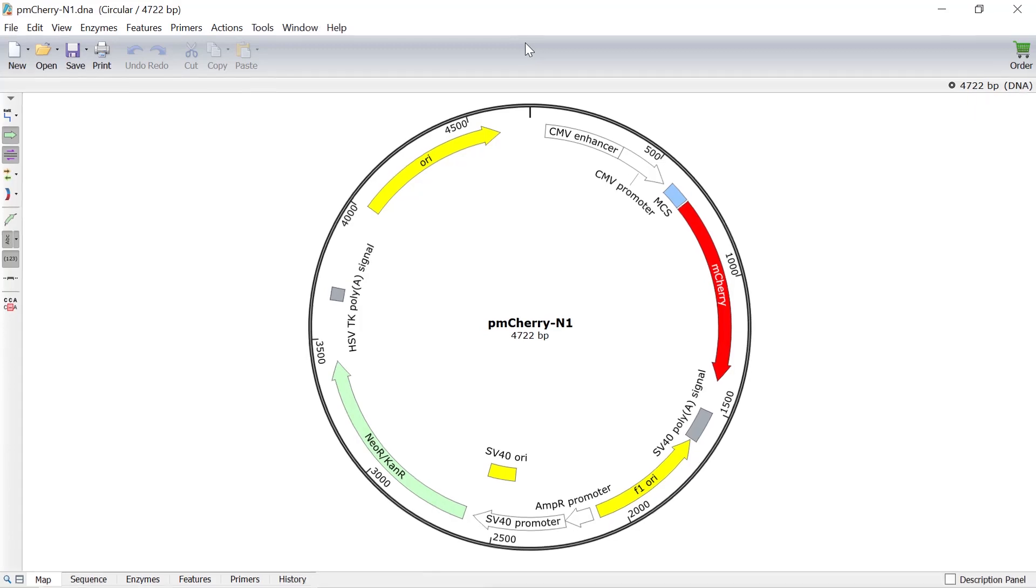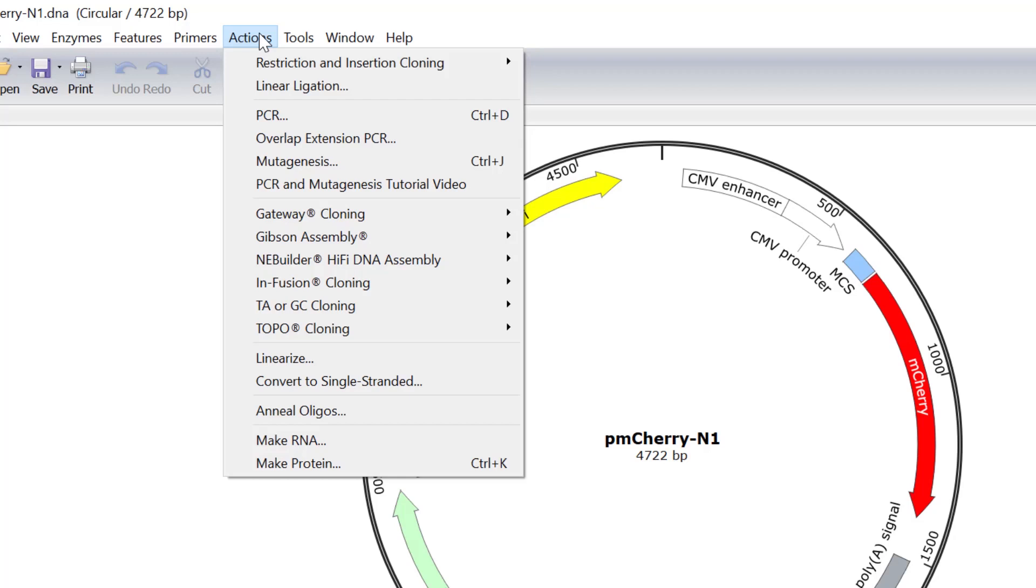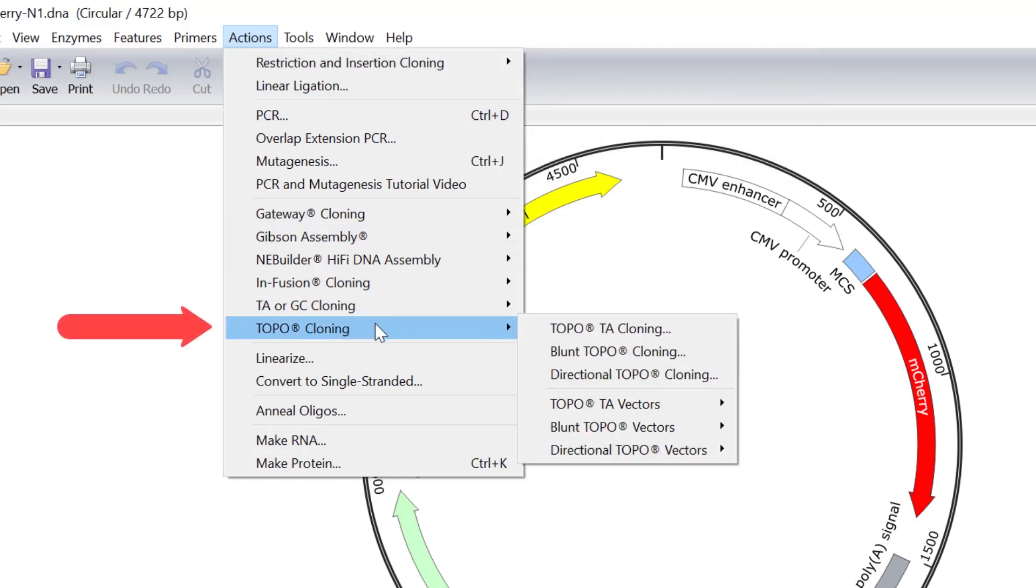To begin, go to Actions, Topo cloning, and select the desired variation from the submenu.